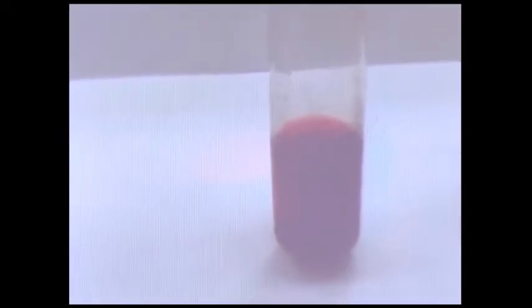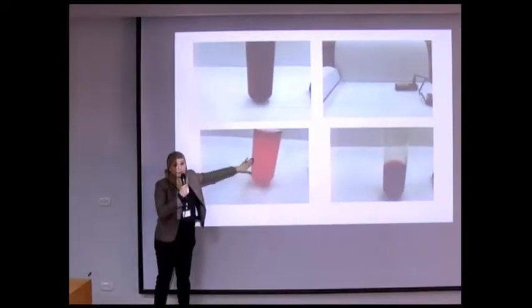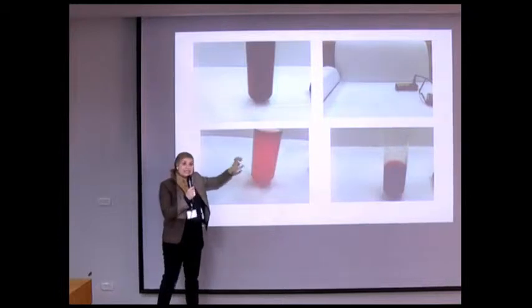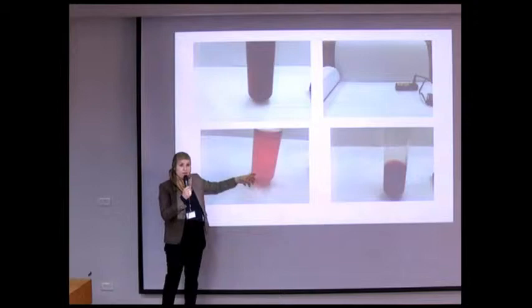This is the micro emulsion solution. You can see here the shiny spots inside the solution. This is because of the scattering of the light by the micro-sized spherical structures. And when we reduce the size of the spherical structures to nanometer size, the same solution became more transparent. It's difficult to see the shiny spots. It still exists because we have 400 nanometer sized spherical structures, but it will be less. That's it.